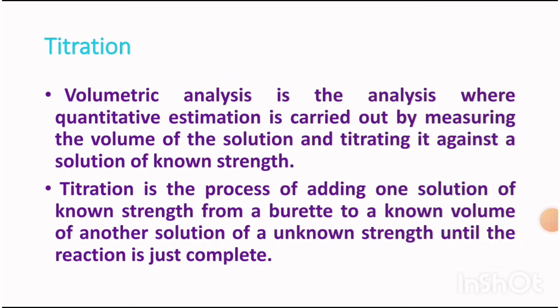Titration. Volumetric analysis is the analysis where quantitative estimation is carried out by measuring the volume of the solution and titrating it against a solution of known strength. Titration is the process of adding one solution of known strength from a burette to a known volume of another solution of an unknown strength until the reaction is just complete.